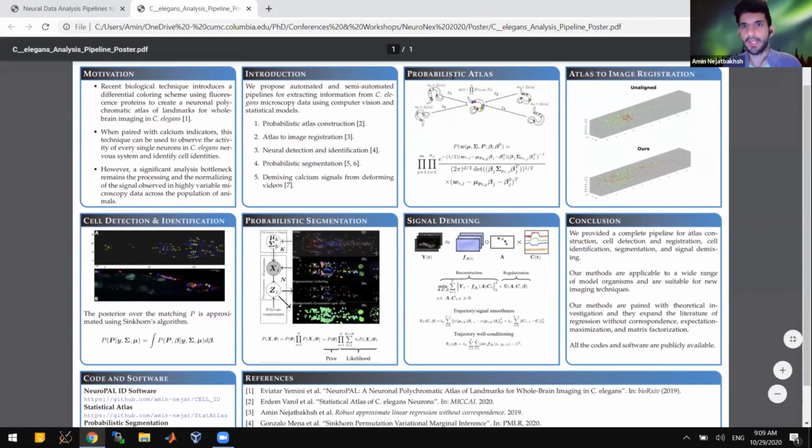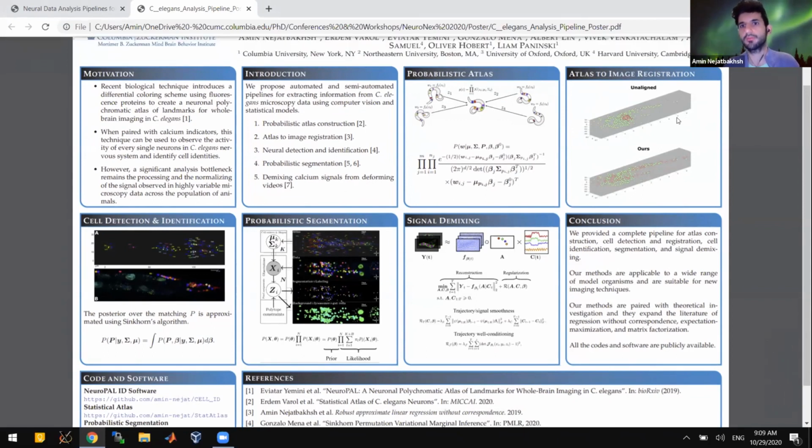The atlas depends on the stereotypy, and this other method, which is point cloud registration, has a rich literature. We also did some theoretical work. If you have two point sets that you want to register, depending on the type of problem, you can definitely do that. If you have two images and you want to find some sort of assignment or identity detection between them, two point clouds that you want to match, that is possible.